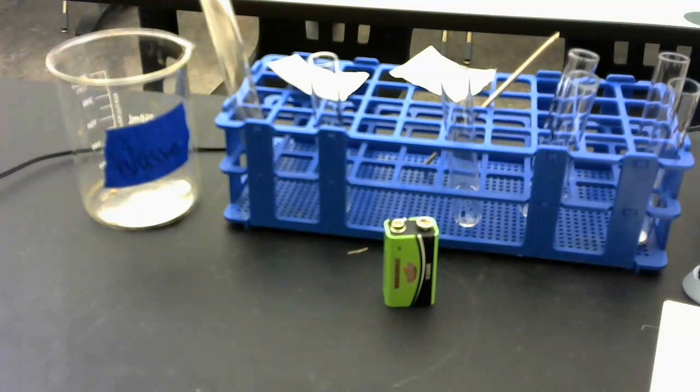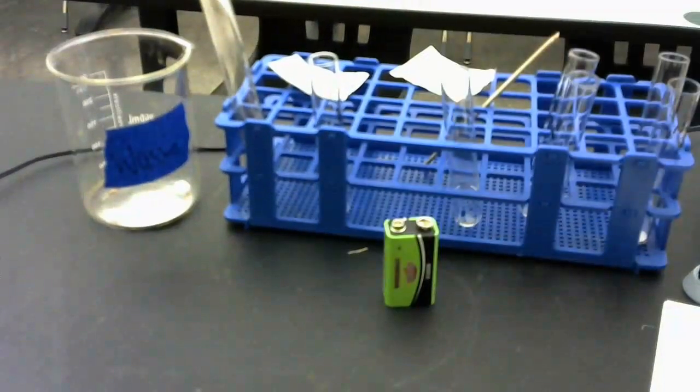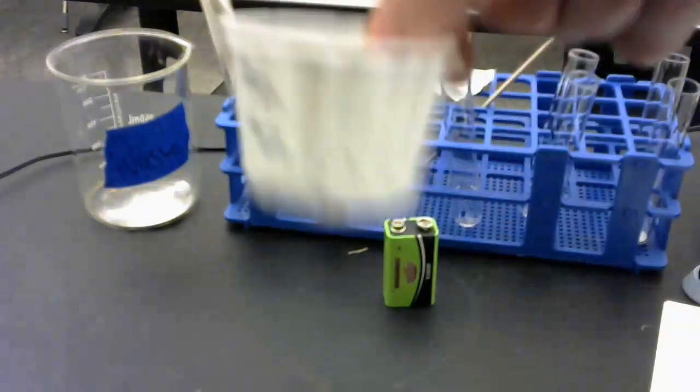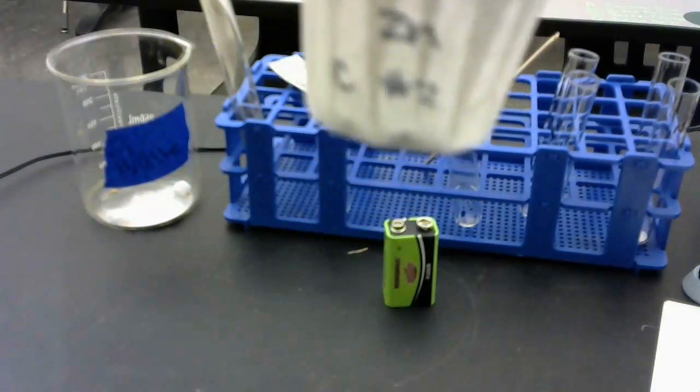Okay. Now, while that is reacting, we're going to place a couple of pieces of mossy zinc metal in a test tube, approximately a quarter of the way filled with 3 molar HCl. Place a stopper loosely on the test tube. After 3 minutes, light a wood splint and insert the flaming splint into the mouth of the test tube. So I'm going to go ahead and take my stopper. So everyone should have a stopper at their lab station. Make sure that your stopper is big enough to not fall through. And then everyone should have, this is their zinc. So Zn, number 2, because it's lab C number 2.